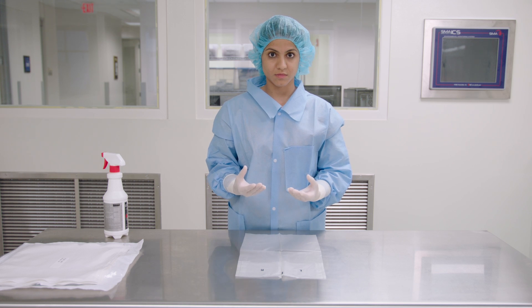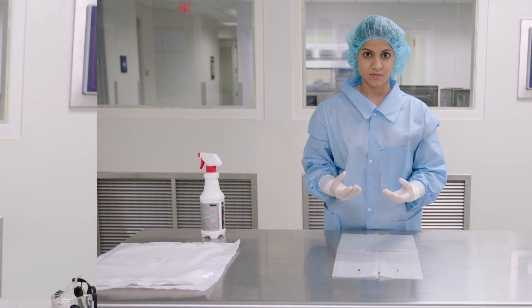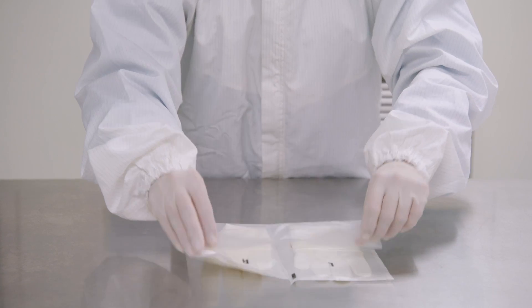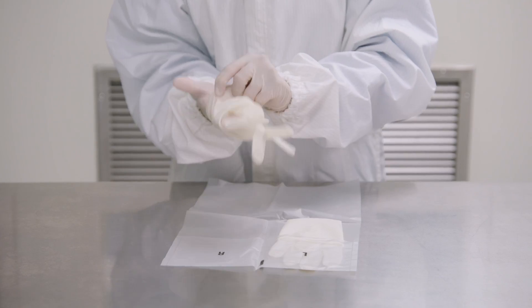Making sure your gloved fingertips do not touch your bare forearms or wrists. Remember to keep clean with clean and dirty with dirty. Continue the gowning process, then repeat with the second pair of gloves.